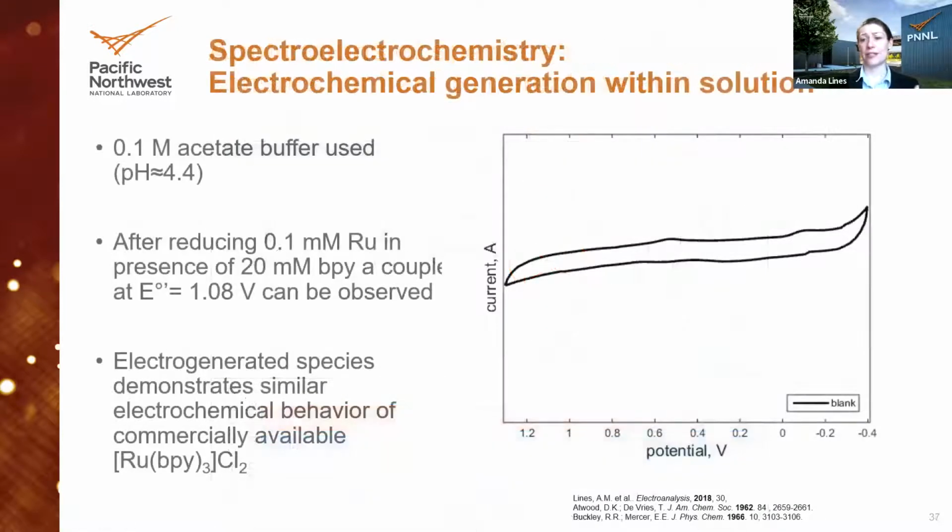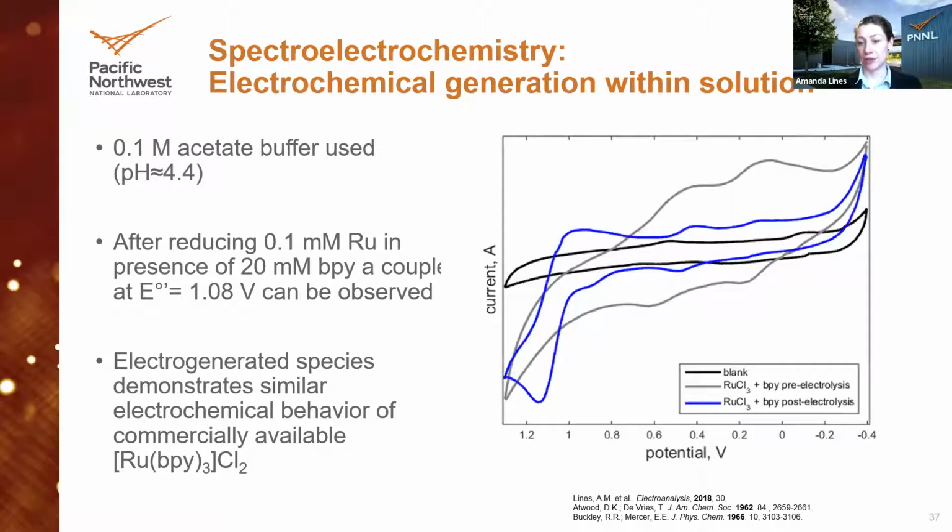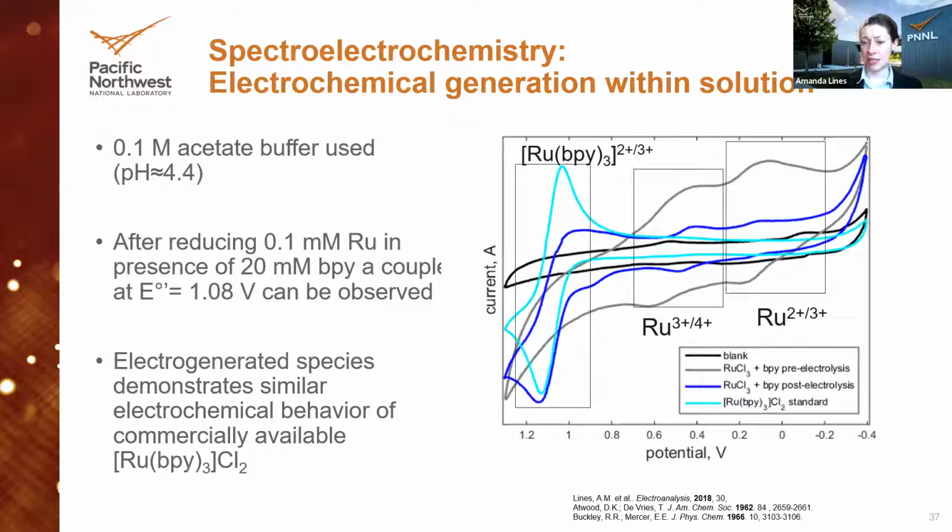And to dig into that, we did a lot of electrochemistry exploring the system, looking at our blank system, where of course there's no electrochemical activity, looking at our ruthenium starting material once we get it in there. And of course, we see a lot of messy activity. Again, ruthenium is truculent. There's a lot of stuff going on there. But if we add in that sensitizing ligand and we reduce it for an extended period of time, forcing all of that ruthenium into the 2+ oxidation state that will combine with your sensitizing ligand, we can then electrochemically characterize the system. We see some new behavior grow in. And in fact, if we break down that behavior and compare to standards, we actually see that we're getting a lot of indication that we're generating that target optically active species.